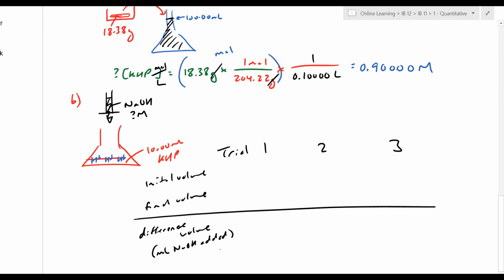So in some sense, the numbers themselves aren't giving the full story. I had the 0 mark up above, I had the 50 mil mark down below. I just take one reading, take another reading. By subtracting the two, I figured out how much I actually transferred. So I copied those numbers down on the side here. 11.24 plus or minus 0.05.